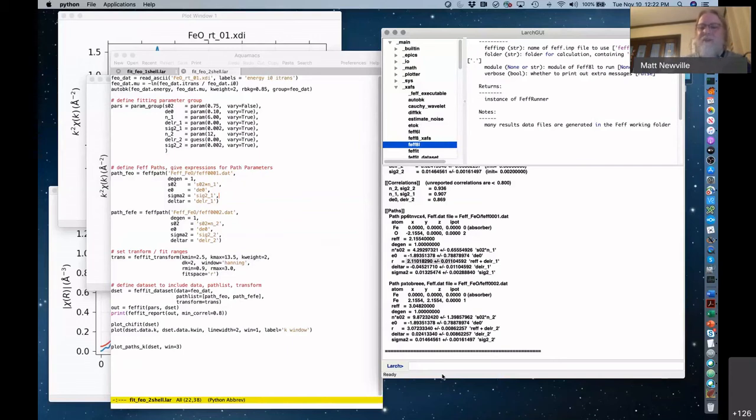The tools are available. We have the FEFF8 and the libraries. We've done that part. We haven't gotten into the fitting code yet. So like with a fitting GUI, or other complex analyses components, if people are interested in that, this is all open source and it's in Python. It's easy to work with. The code is pretty.